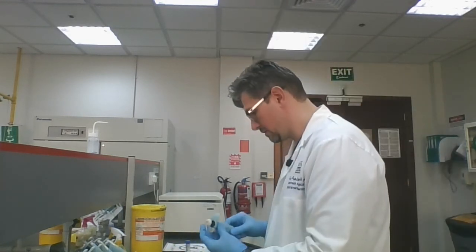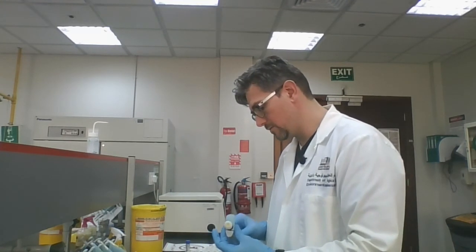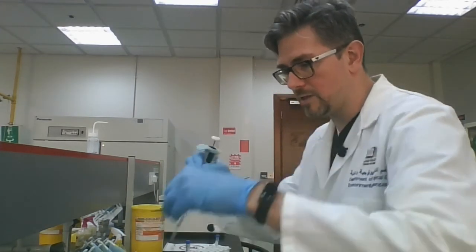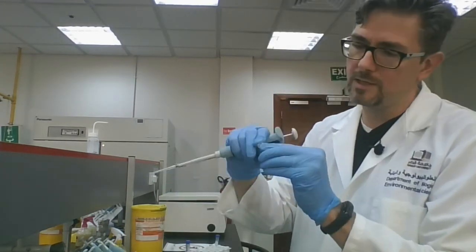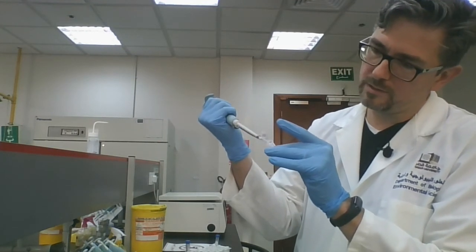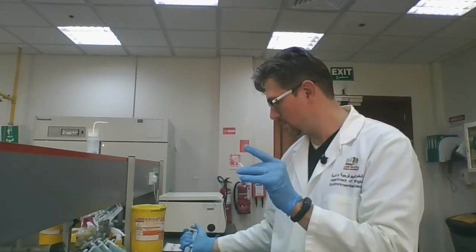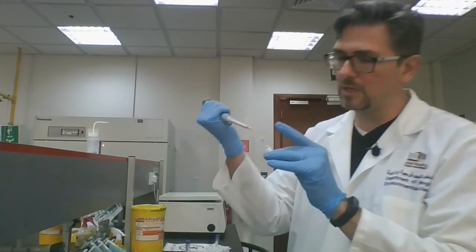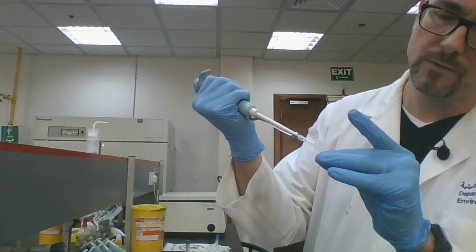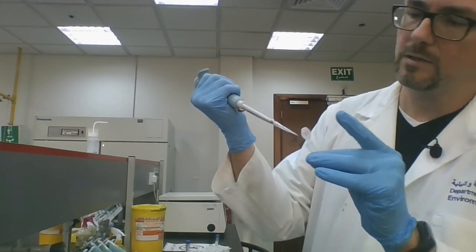So again, I will just set it to 175. This way I can just do the same volume both times. And again, just open it up and take out what you need. I'm taking it from the top because that's where most of my aqueous phase is. So I'm trying to keep my tip as far away from the phenol as possible, and just underneath the surface of the liquid. Okay.